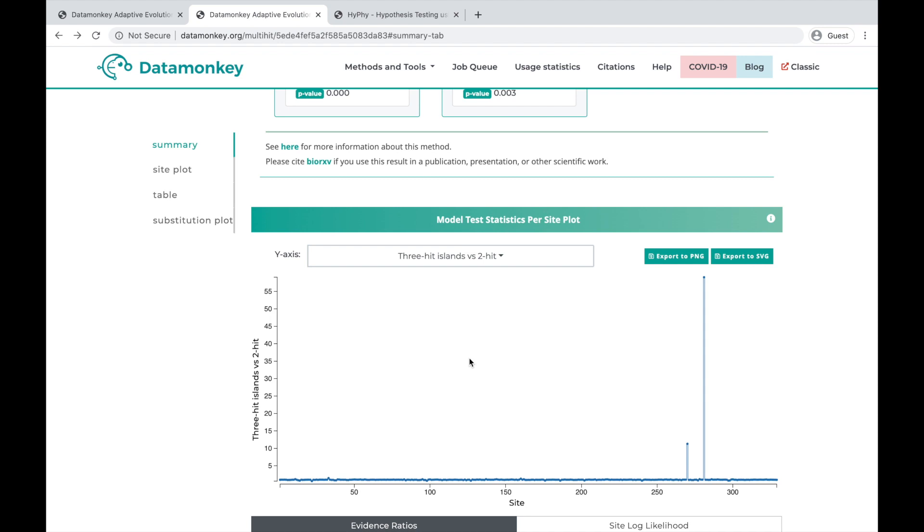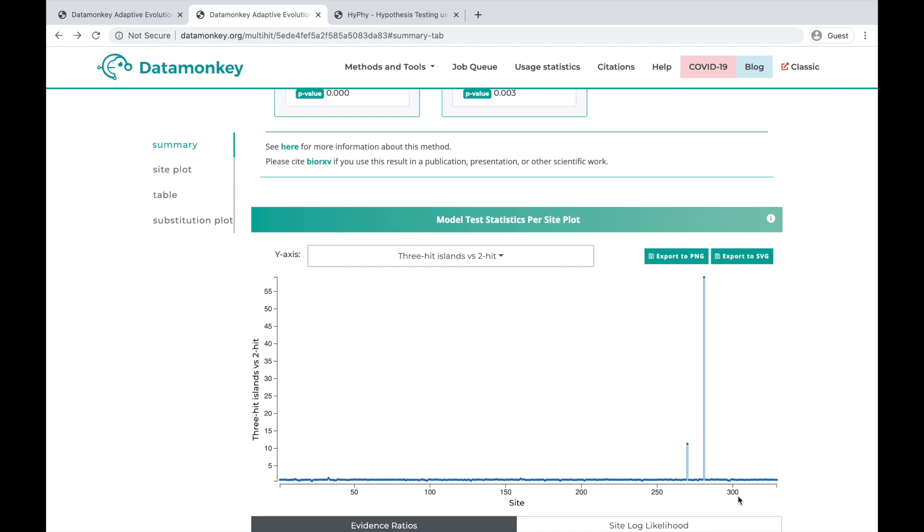For example, when we look at the evidence ratios for triple-hits with synonymous islands versus double-hits, we see that there are these two sites that contribute greatly to the signal, while most of the rest of the sites have an evidence ratio below two.